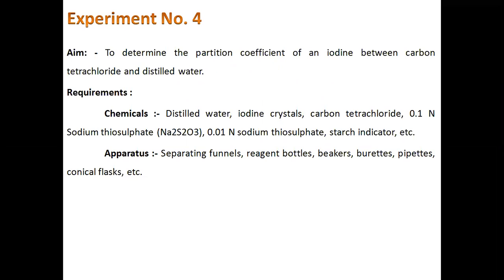In requirements, chemicals like distilled water, iodine crystals, carbon tetrachloride, 0.1 normal sodium thiosulfate, 0.01 normal sodium thiosulfate, starch indicator. Apparatus like separating funnels, reagent bottles, beakers, burettes, pipettes, conical flask.